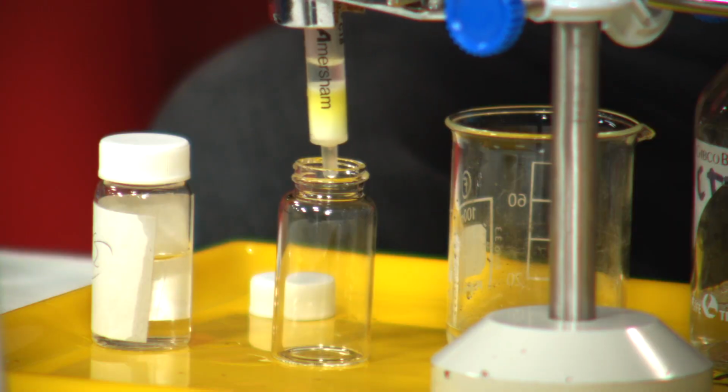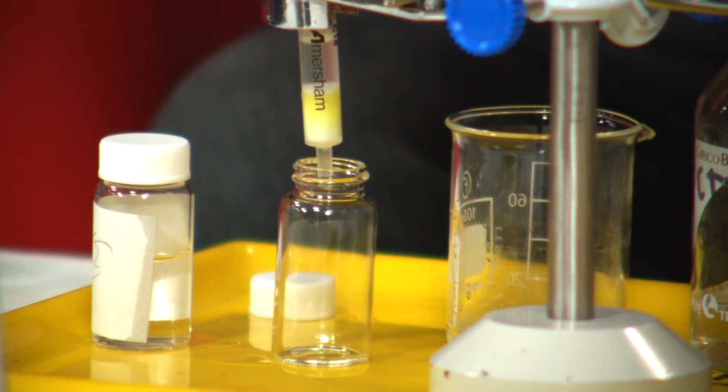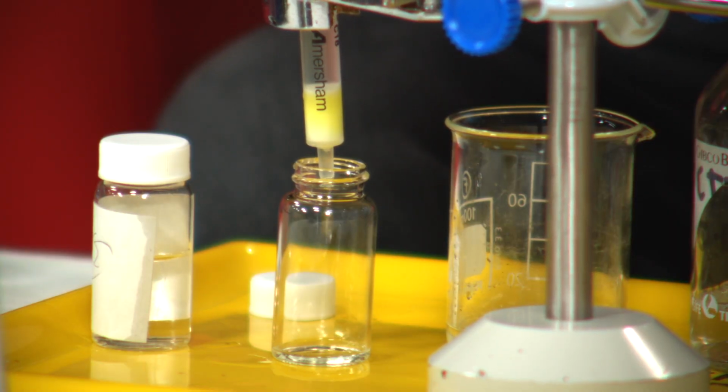And what we've essentially done through this whole process is separate the yellow from the blue food dye. So let's just finish this off. Hopefully this is indeed the right mixture. Now, while you're doing that, Nick, Claire, I wonder if you could tell us how this links to research.